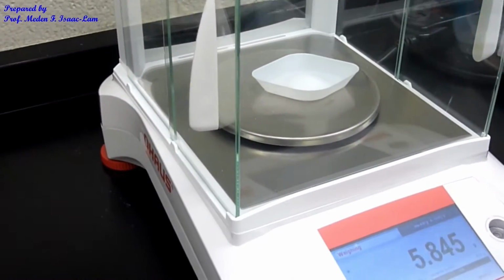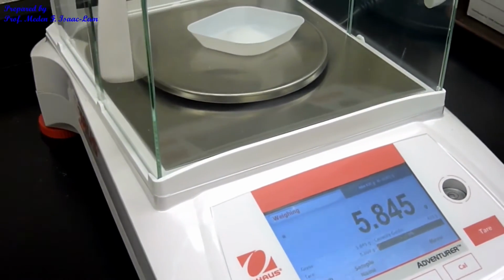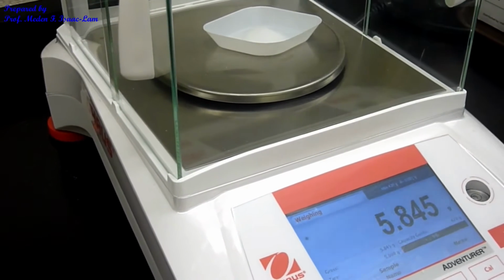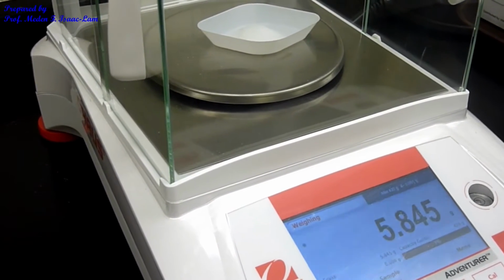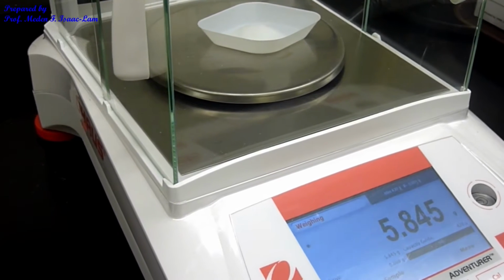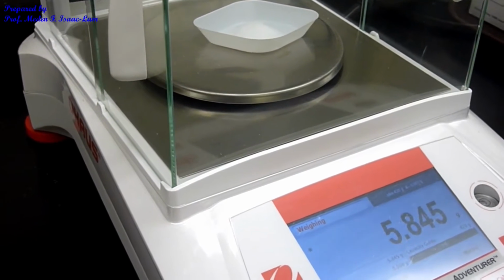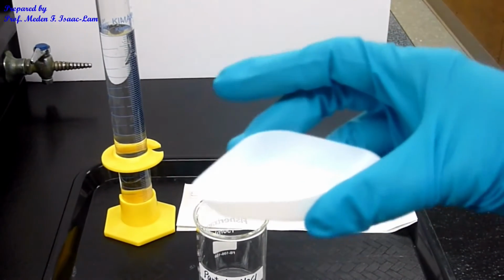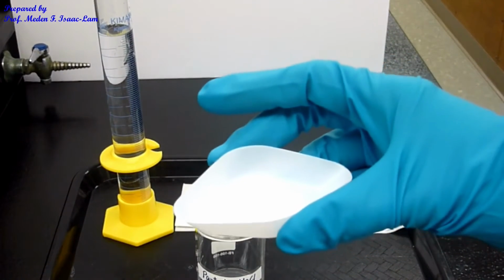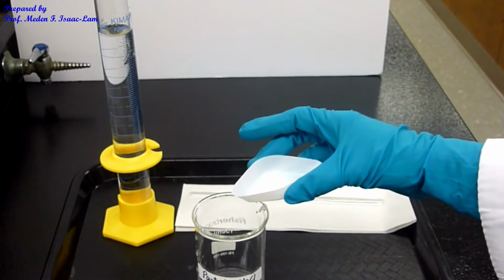So I close it, and we're going to leave it for a few seconds or a few minutes until it doesn't fluctuate. Right now I have 5.845. So write this down, please. 5.845 grams is the weight of the NaCl. This is now the salt that I weighed, 5.845 grams, and I'm going to put it now in the beaker.